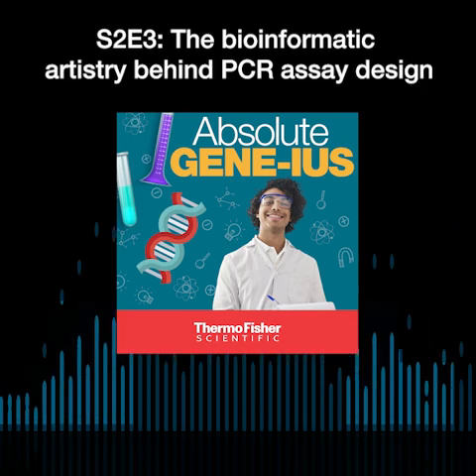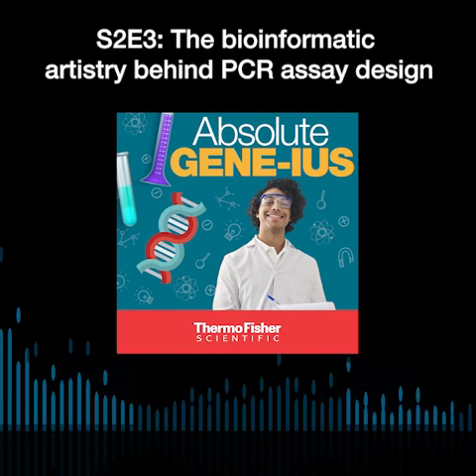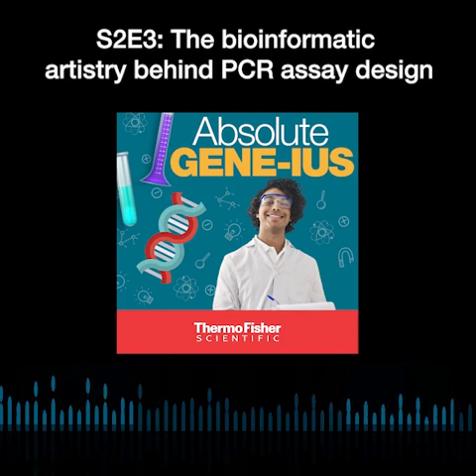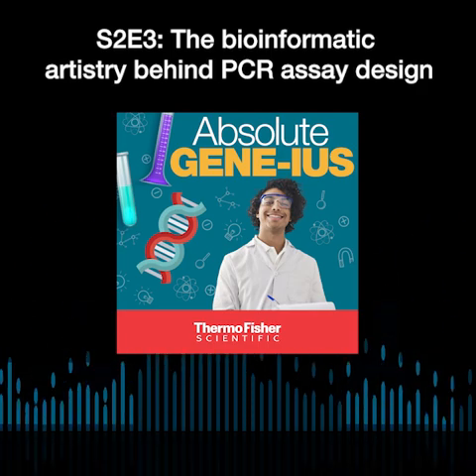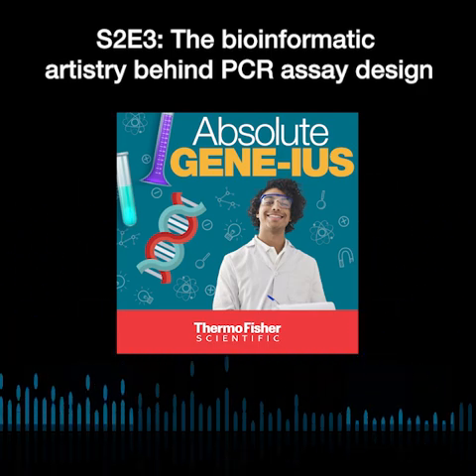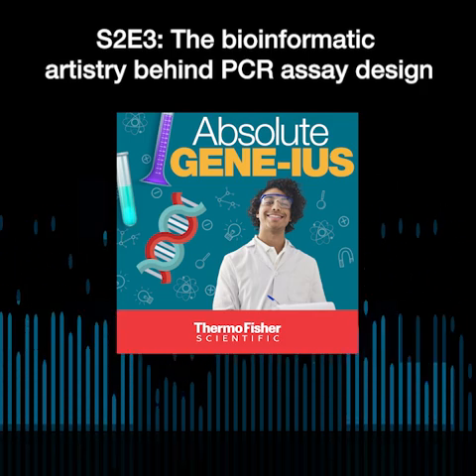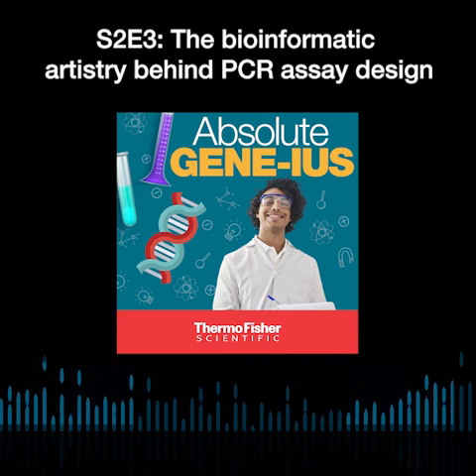Some of the things that we try to learn beforehand when we start designing an assay is what's the kind of sample that we are dealing with. So what's the level of fragmentation in the templates that we should consider? Oftentimes, if you try to cross-apply an assay that was initially designed for a different application on something else, then the issue that people can run into is that your amplicons are oftentimes longer than the template in the sample.